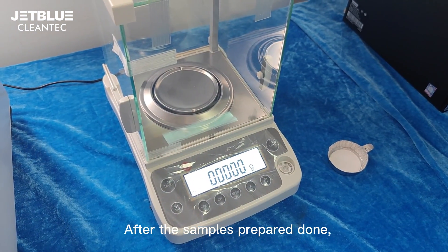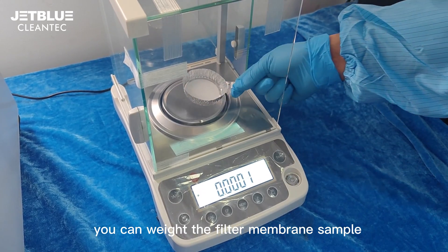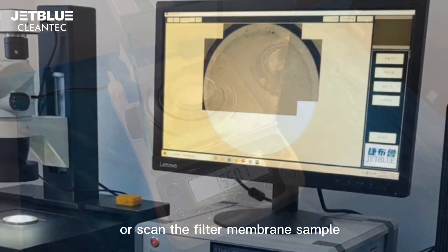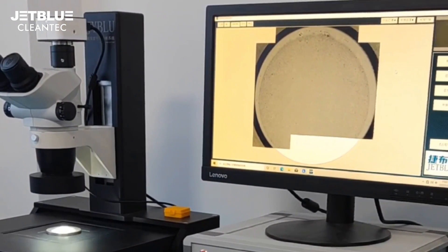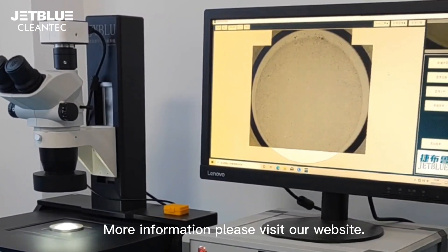After the sample is prepared, you can weigh the filter membrane sample, or scan it under a microscope for image analysis. For more information, please visit our website.